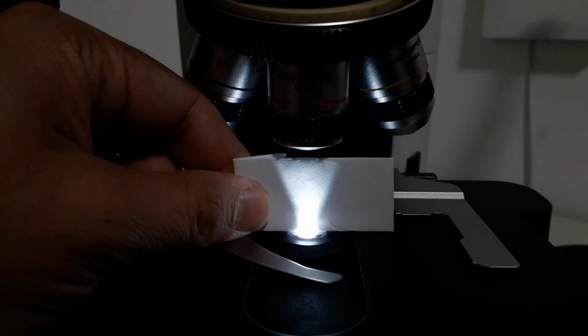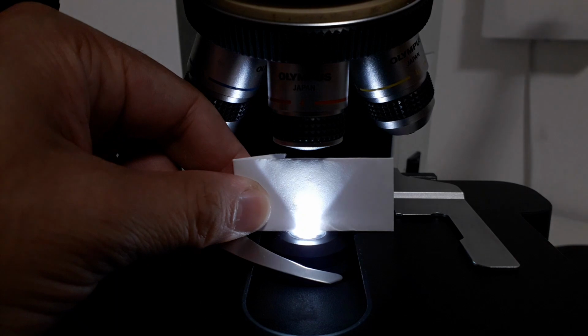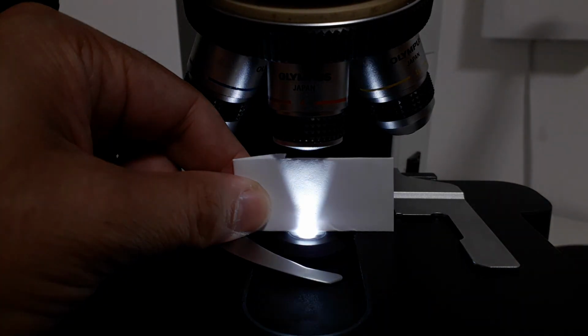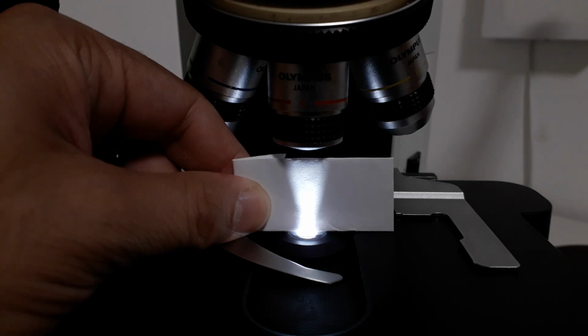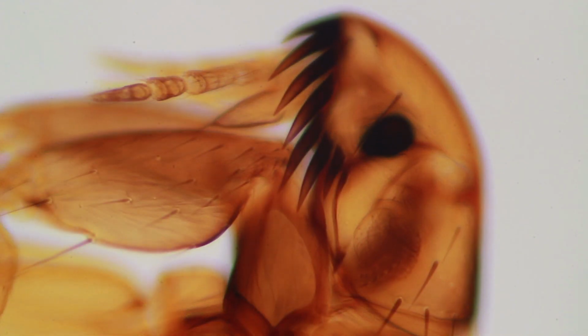and as a consequence the image will become, of course, a little bit brighter, but that is not the main point. It is also like this, that the depth of field will be reduced when you open the iris diaphragm of the condenser. If you close it too much, so basically if the angle of the light beam is much smaller than the numerical aperture, then you actually also lose resolution.